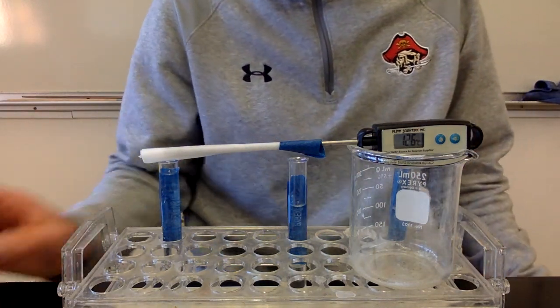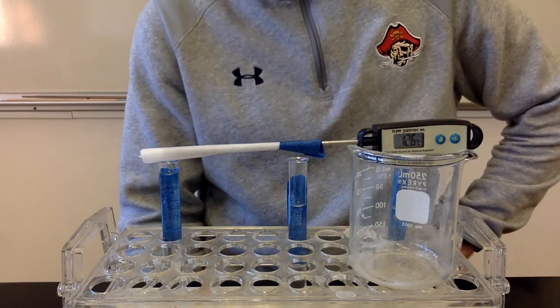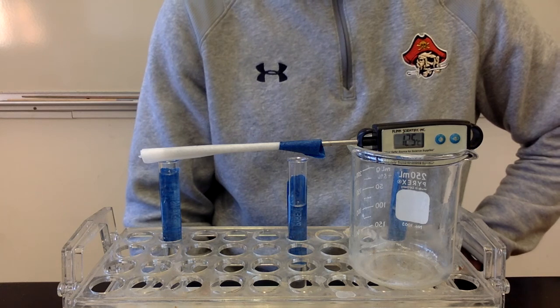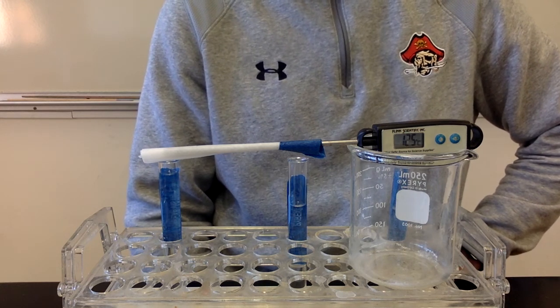All right, guys, so you're continuing to record the temperature every 30 seconds. You can see right now we're at 12.6 degrees Celsius, 12.5 degrees Celsius. The temperature's come down significantly since we first started. And we're going to compare this to the other liquids.